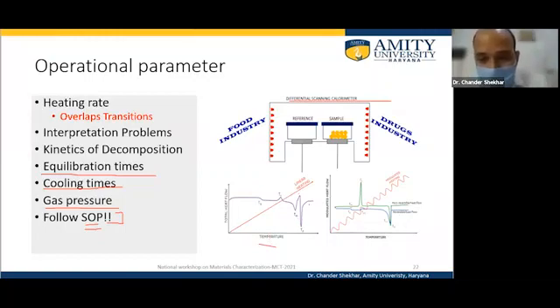So there is linear heating and modulated heating. This program is given for the same type of transition. What we can see here is that for a material, the resolution of the peak is very much enhanced when modulated heating is used compared to the linear heating rate. This feature is generally available in the advanced data acquisition software. It is very important for increasing the resolution of the peak or the thermal event that is happening in the cell.